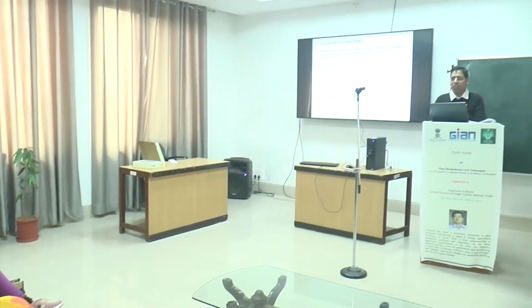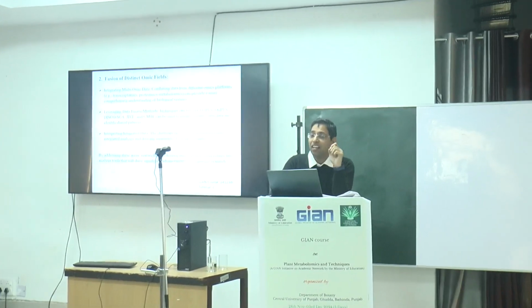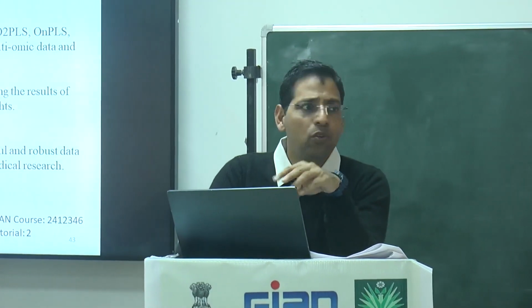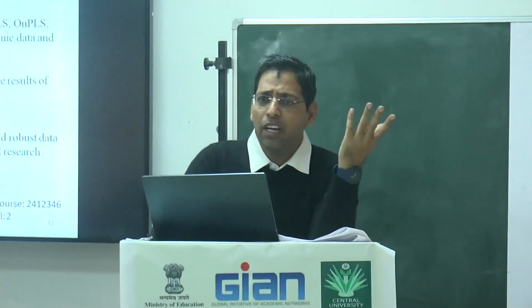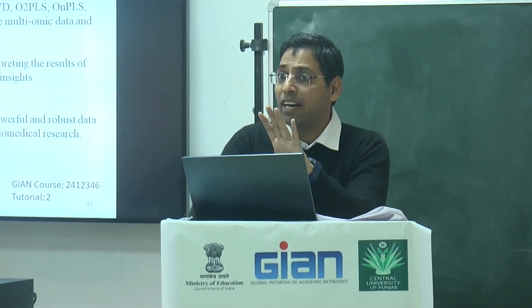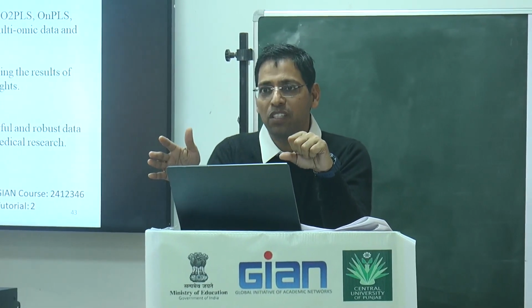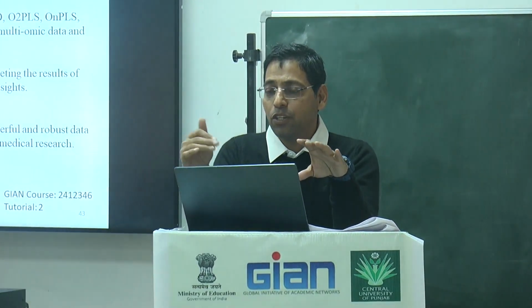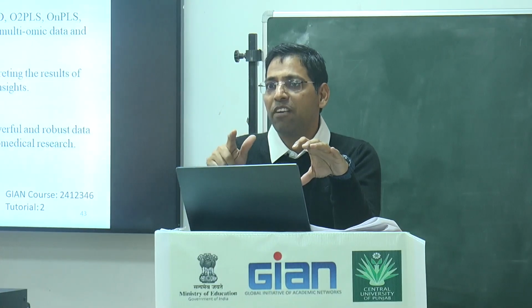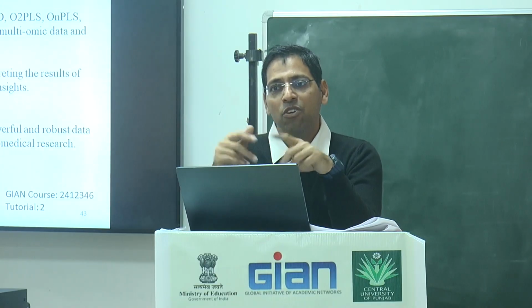The first thing is that we have to know where the peak is actually coming from, and then the peak can be easily identified. So method development requires time, maybe 6 months. And remember, if you think you give the sample to someone and he will just insert the sample and give you the result, he will never work with his best sprint. So for the best sprint, we say give this machine to us, be confident for a few days, you just learn it and then put your sample. Every night you will get the answer to your query, whatever you raise during the day. Next day you start again and one day you will get the peaks.